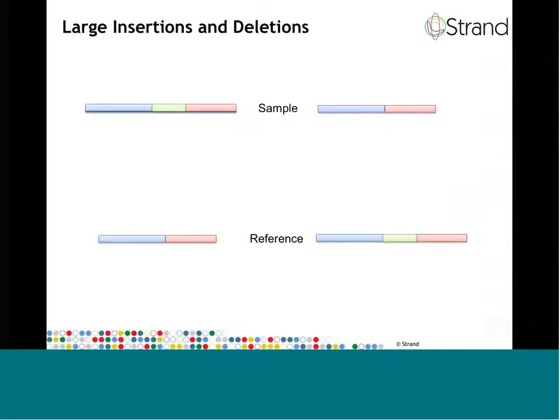So the SNP detection workflow steps, as shown in the previous slide, allow for the detection of relatively small insertions and deletions, typically on the order of a few or a couple of tens of bases. But larger insertions and deletions can be detected as well with Avadis NGS when using paired end or mate paired data, as shall be demonstrated by the examples here.